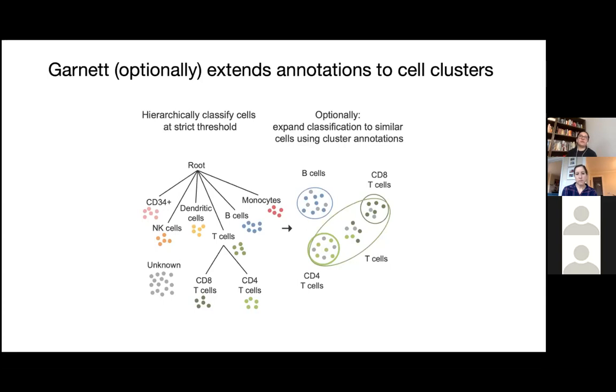That is very helpful in large data sets where you have, suppose, like 20 clusters, which are very well separated and are clearly distinct cell types. That's when the cluster extend option works very well to engulf those unknown types, because it's possible that the algorithm didn't capture them. Once you extend it, it's going to be considered a T cell. And you can always check it, because you can subset out the cluster and make sure that everything in there has T cell markers, for instance.